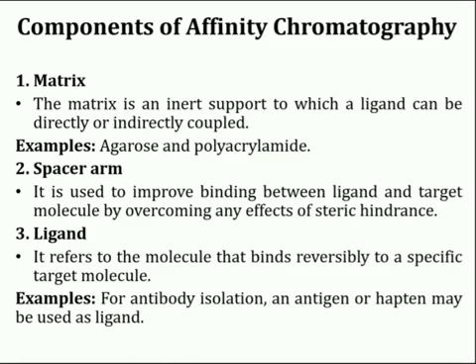Components of affinity chromatography. First component of affinity chromatography is matrix. The matrix is an inert support to which a ligand can be directly or indirectly coupled. Matrix materials should have following characters.